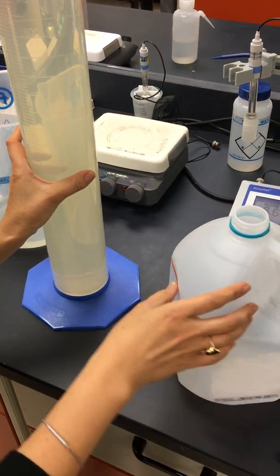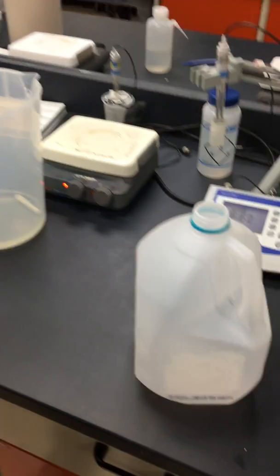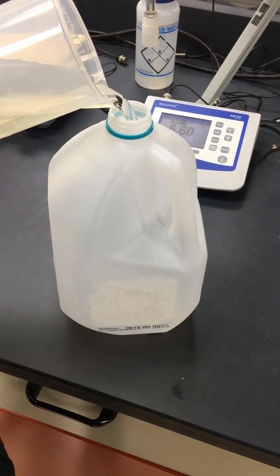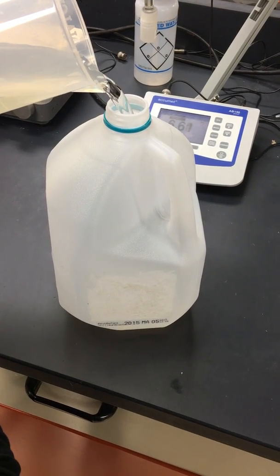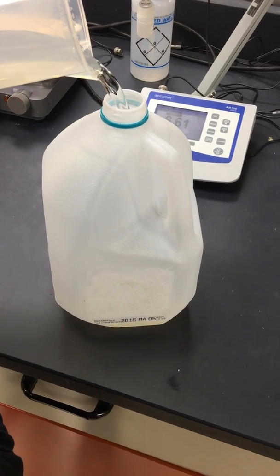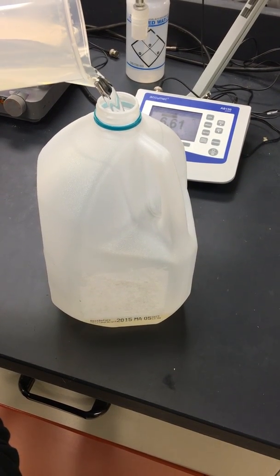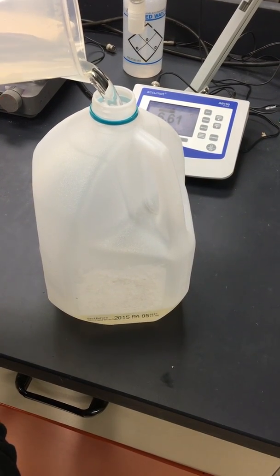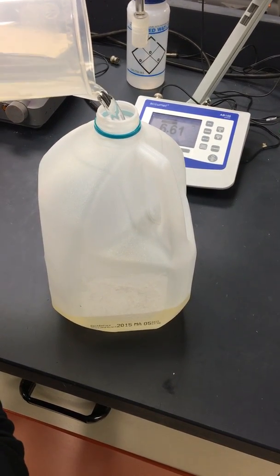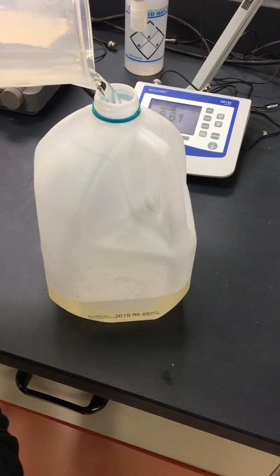We start to pour into the four liters. Again, you have to do this slowly because you don't want to be spilling everywhere. But if you do, it's okay — you can just wipe it down really well.